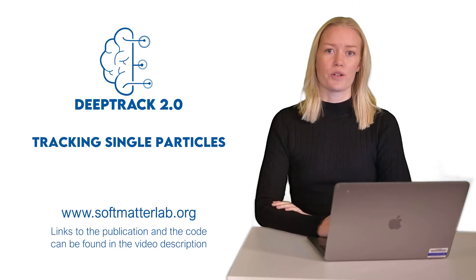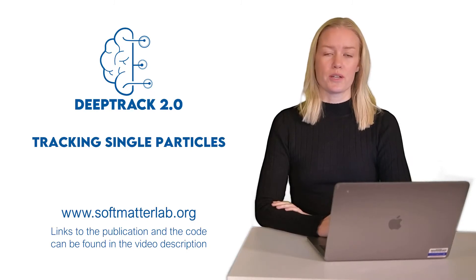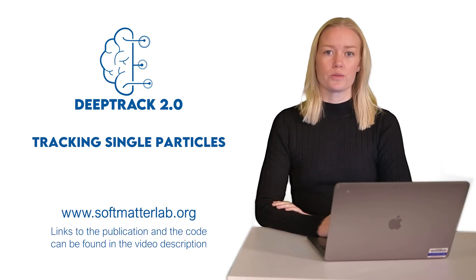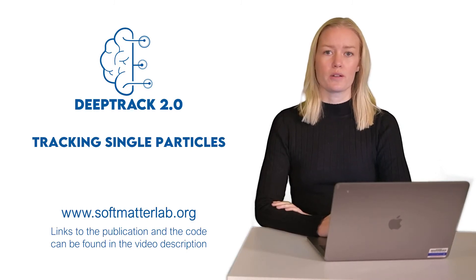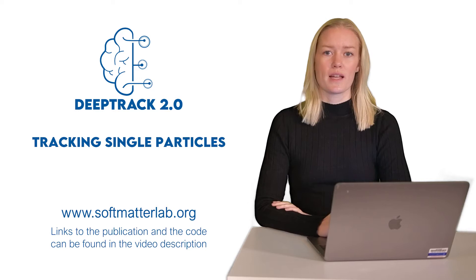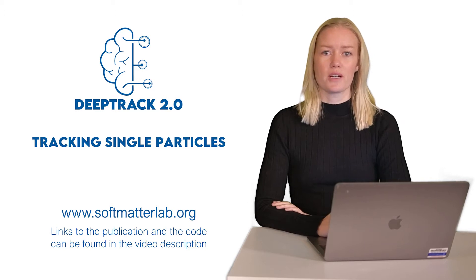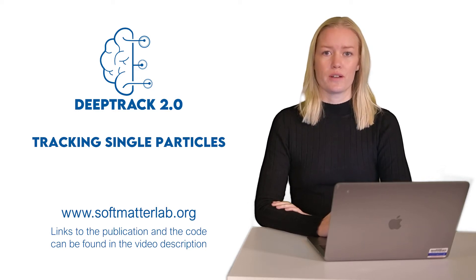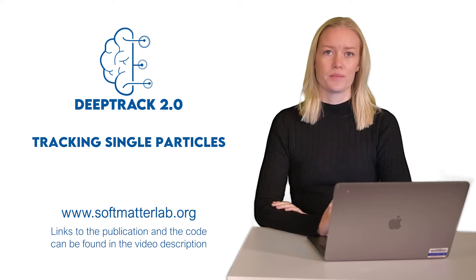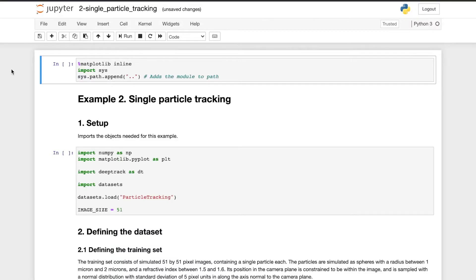In this example, we are going to use DeepTrack 2.0 to track single particles. Hello, I'm Saga and I will be your guide for this tutorial. Let's go through example 2 where we use DeepTrack for single particle tracking.